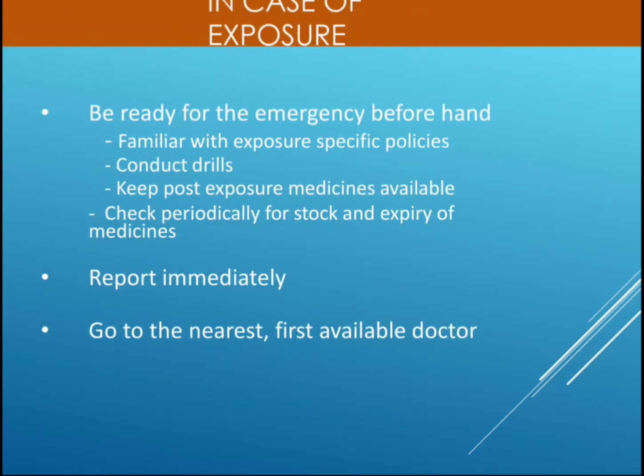Okay. Now in case of exposure, what has to be done? We should be ready for the emergency beforehand. We should be familiar with the exposure specific policies. Then we have to conduct the drills. Okay, then we have to keep exposure medicines available.